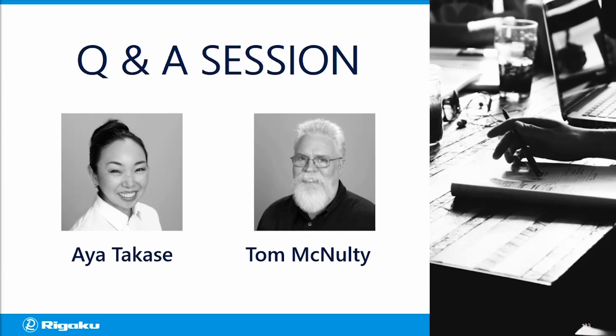Next question comes from Diane in Massachusetts. Says, I've noticed that most of the images you have collected were run with copper or moly. What type of samples would you anticipate chromium giving the best images?